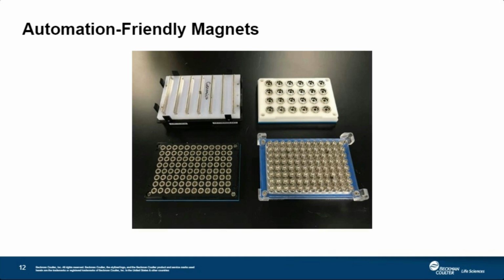There are two key types of magnets, or two primary types of magnets. One is the ring, and that's what the earlier picture showed. If you look on the top left here, though, this is a bar magnet. Essentially, the only difference is that it pulls the sample all to one side, whereas the ring magnet pulls it in a circular fashion to the outside.